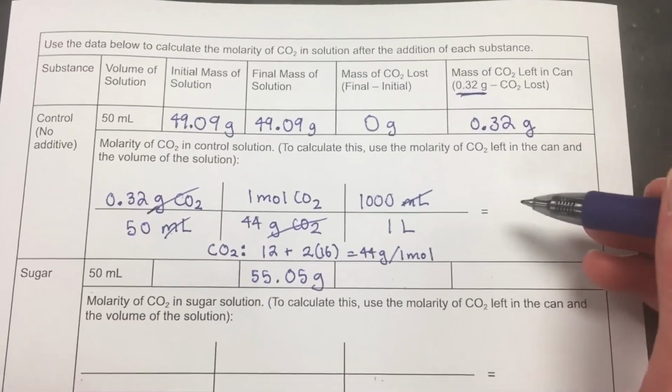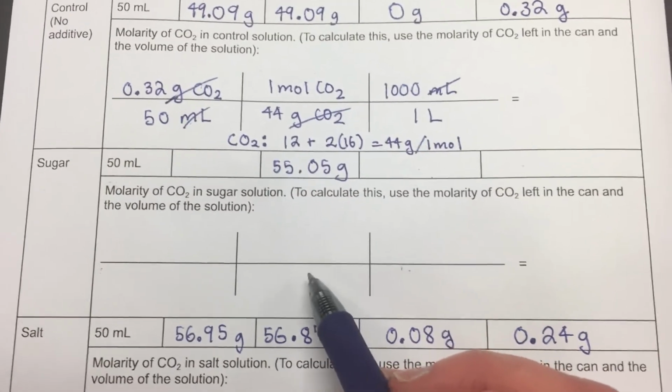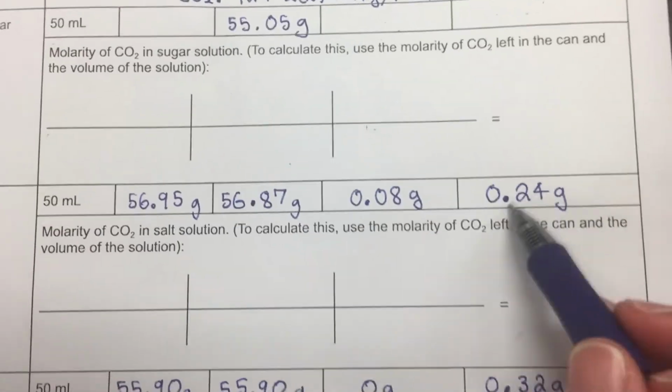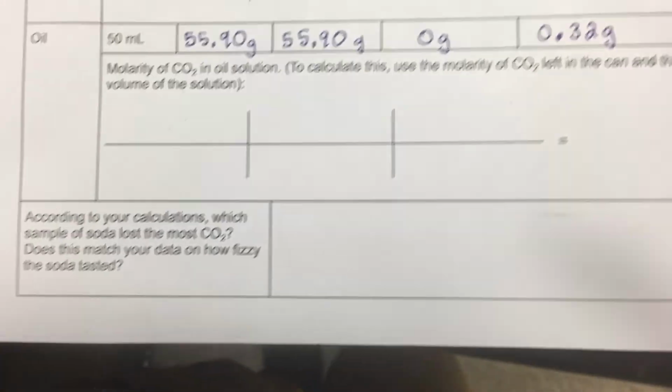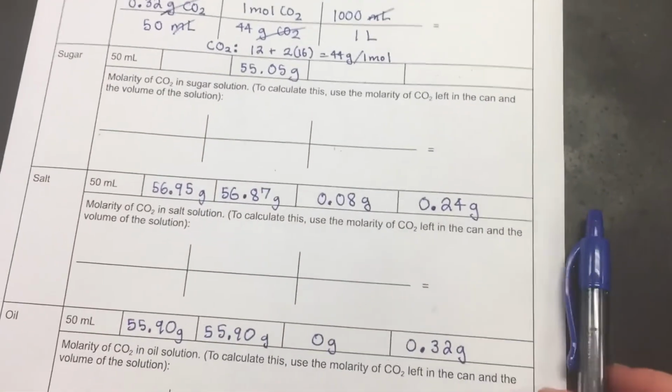And then you just do the same thing for each of these. They're all CO2, so they all have the same molar mass. The only difference is they'll have different masses, because you'll be using this number and this number. Then you can figure out which one lost the most CO2, so which one has the lowest concentration of CO2, or which one had the greatest decrease. Let me know if you have any questions, but that's how that lab worked.